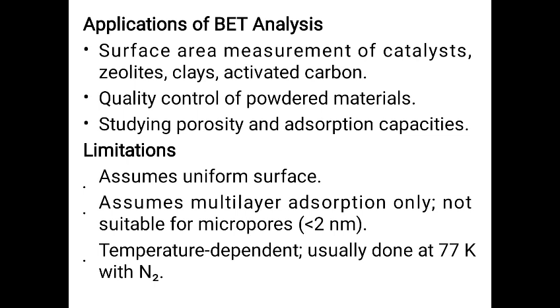Applications of BET analysis. The surface area measurement of catalysts, zeolites, clay, and activated carbon. Quality control of powdered materials. And also, it helps in studying the porosity and adsorption capacities.